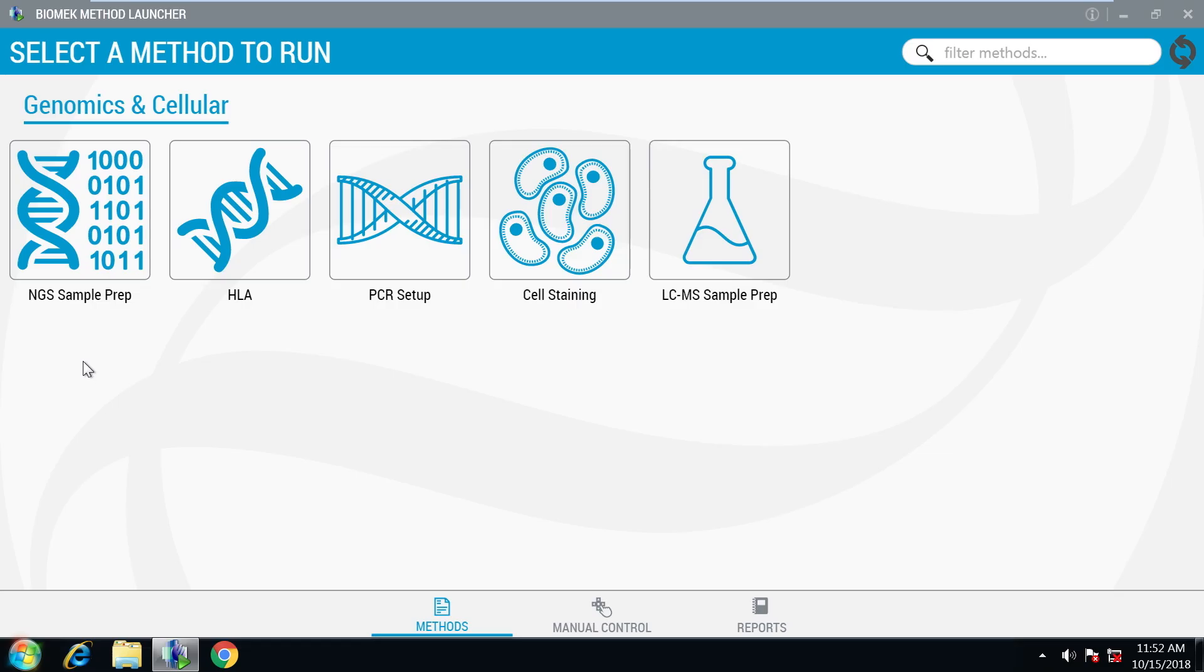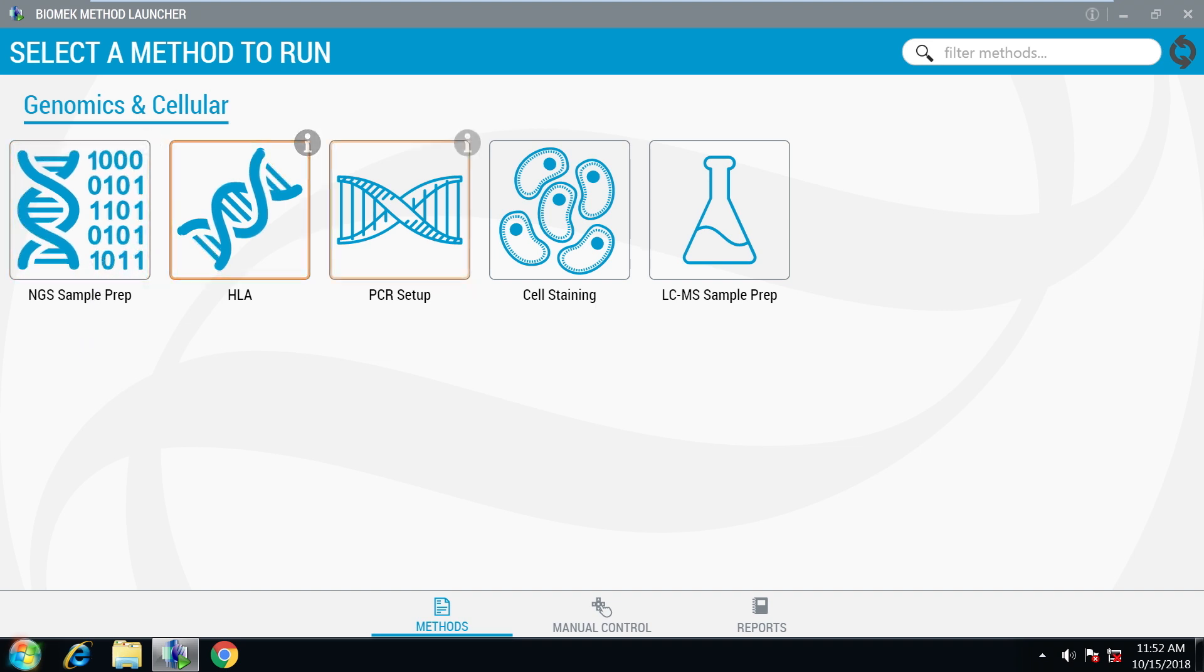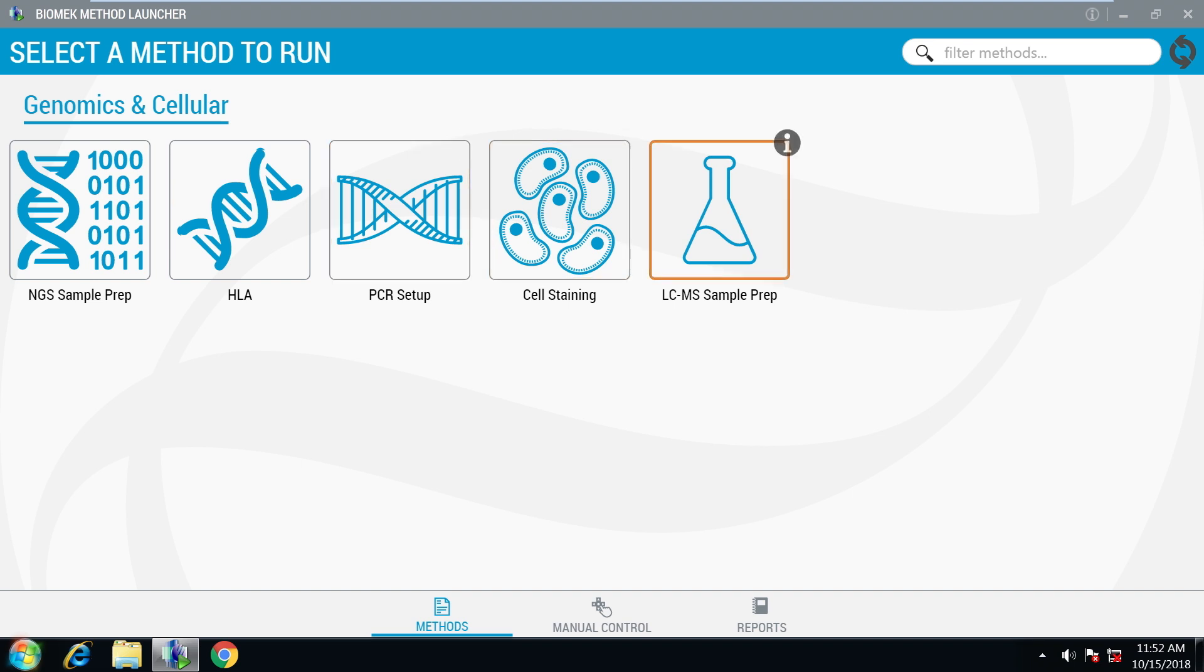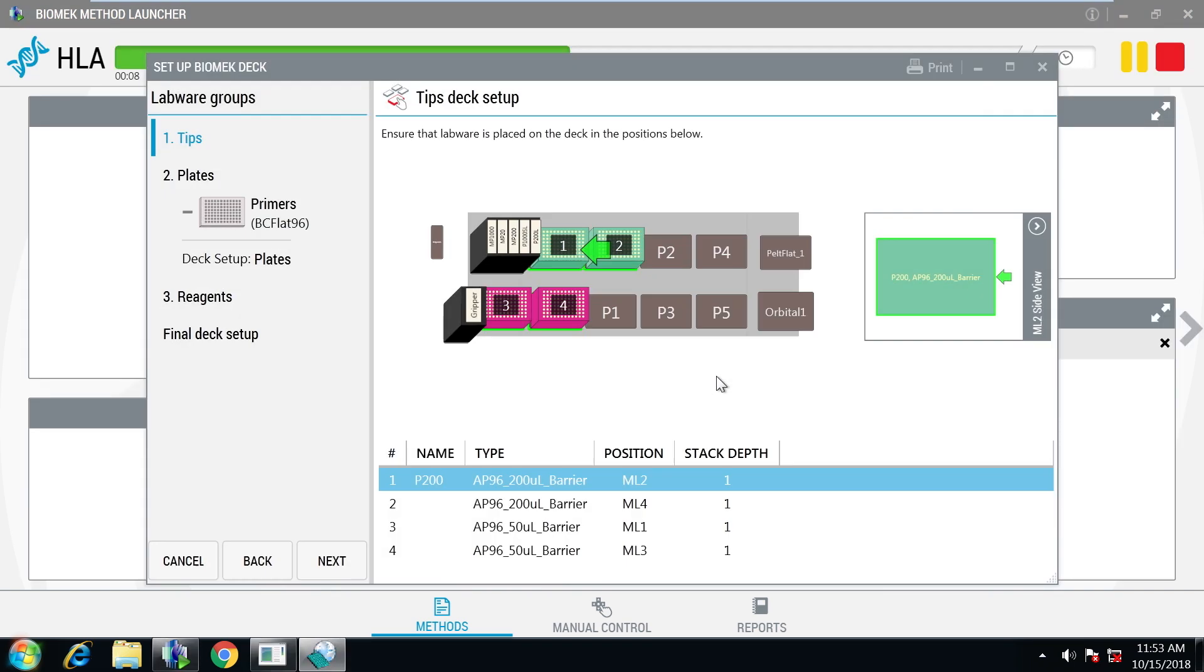Pre-written methods for common life sciences applications such as NGS sample prep, HLA sequencing sample prep, PCR setup, cell staining, and LC-MS sample prep provide push-button operation of the system.